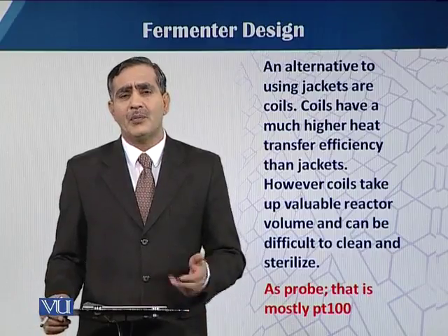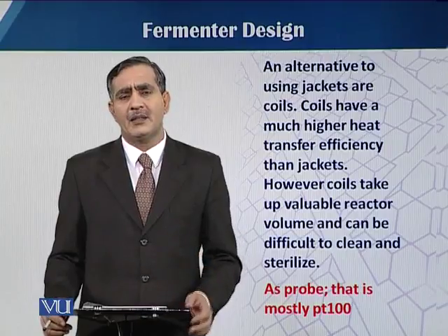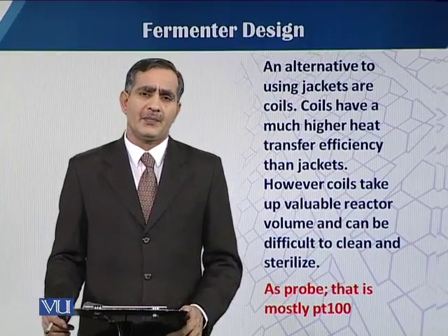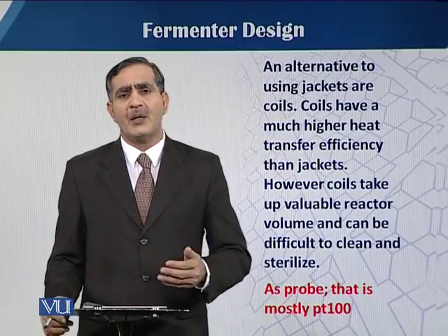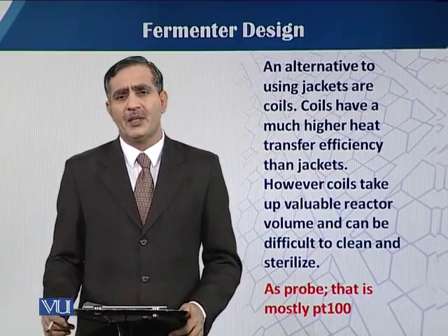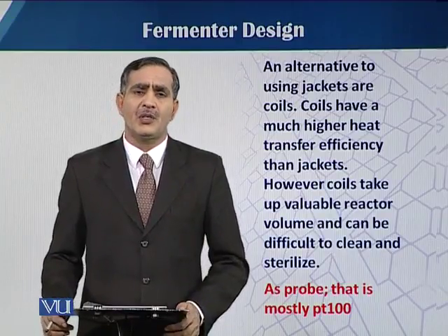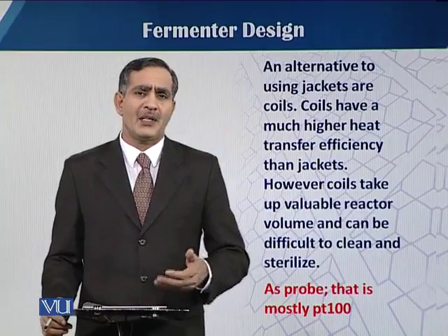As concerns the probe, in most fermenters the PT100 temperature probe is used. What is PT100? We will talk about it later when we talk about the design of the probes. The PT100 is the probe mostly used to sense the temperature inside the fermentation vessel.